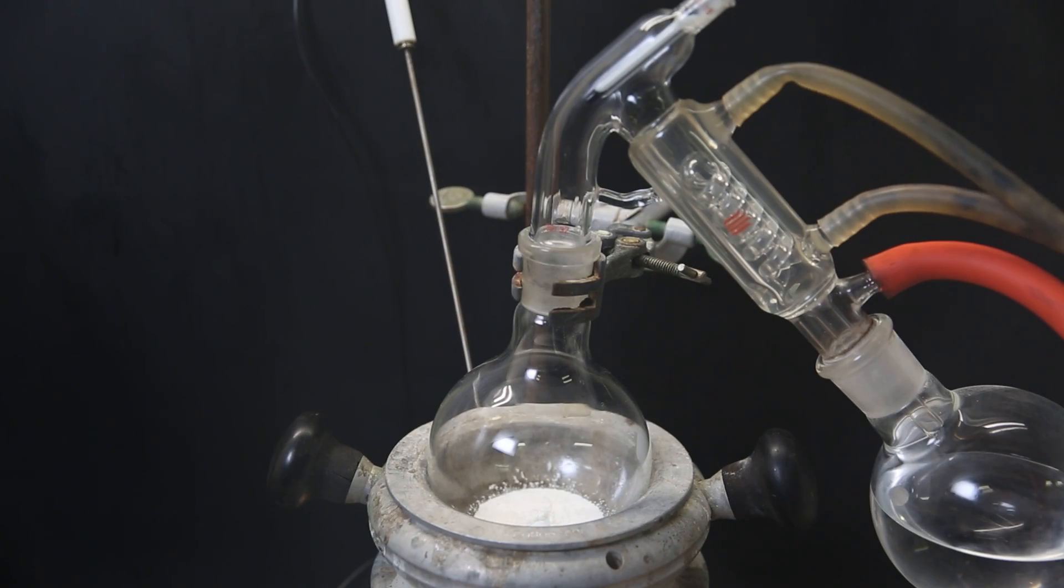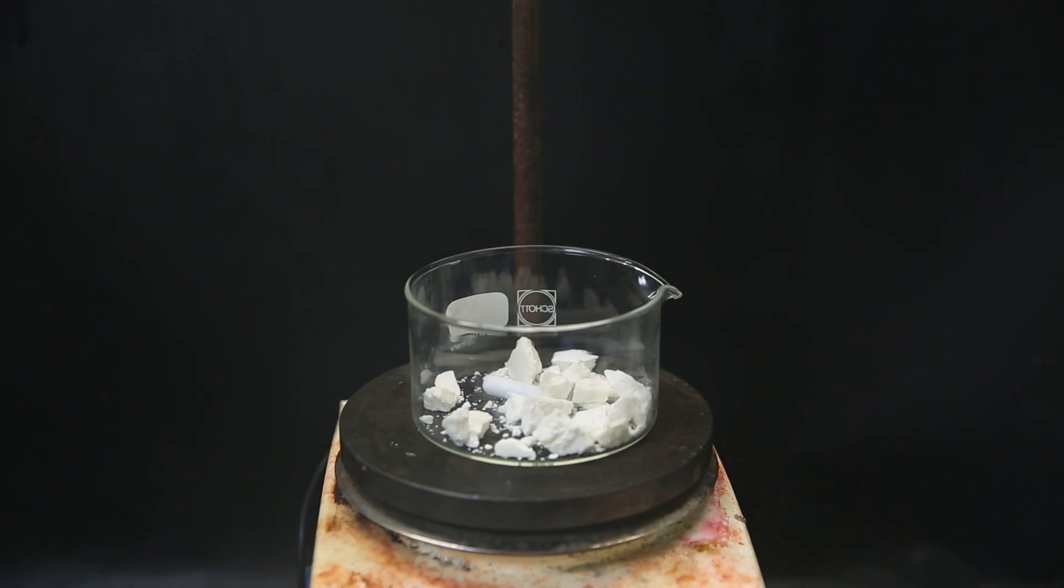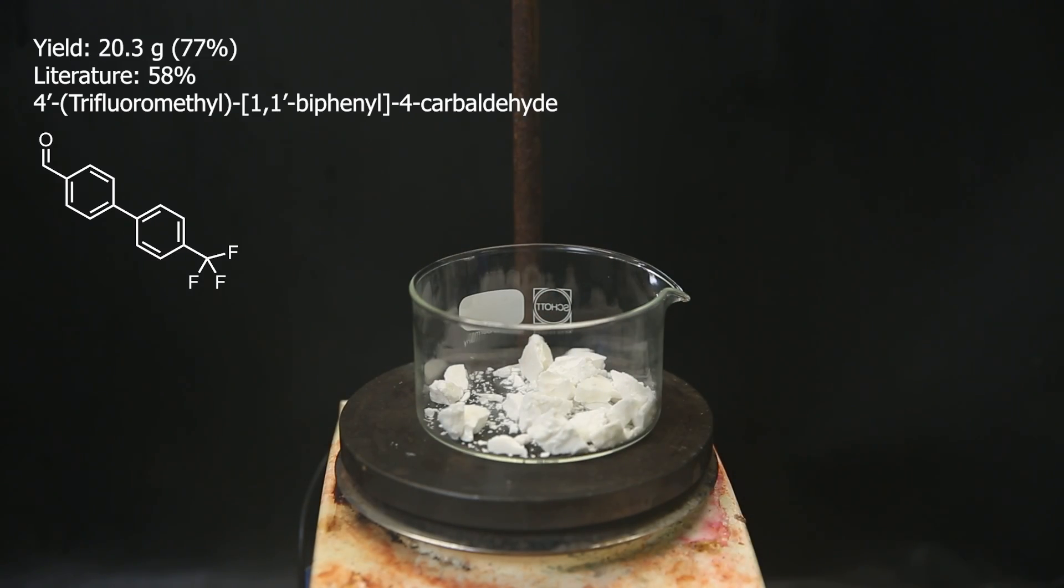After that, a white solid is left behind, and I break it up with a spatula and move it to a dish. The yield turned out to be 20.3 grams, which is 77%. This is more than the 58% from literature, but probably just because of the impurity that is in here and maybe some remaining solvent. Though it's hard to tell if these impurities are actually significant or not.